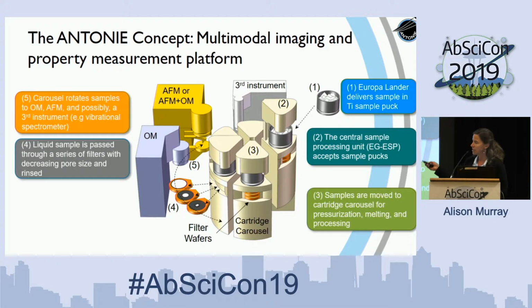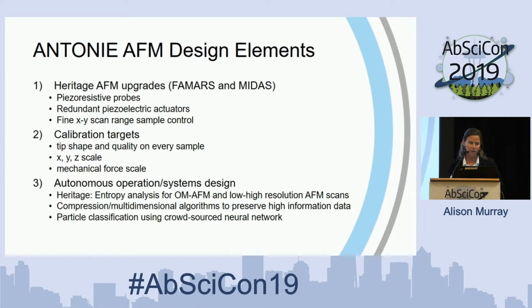The design fits in the 10 centimeter by 10 centimeter space that was described in the PIP. So there's several elements that, even though we're basing this on the heritage design of what has flown before, there are a couple of upgrades that we can do 20 years later than when these developments were made. So piezo-resistive probes can be upgraded, as well as the actuator and fine XY scan range to move the sample.